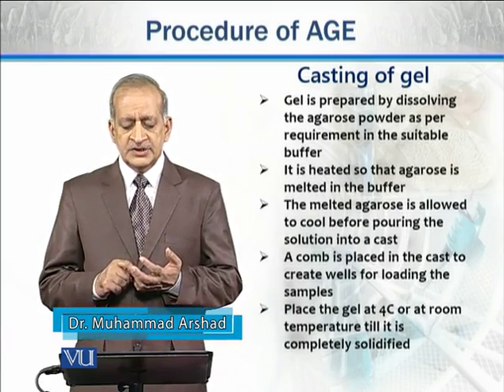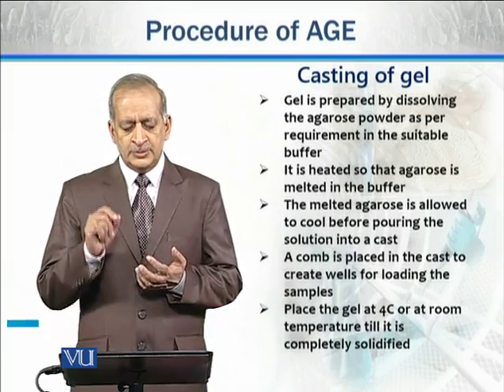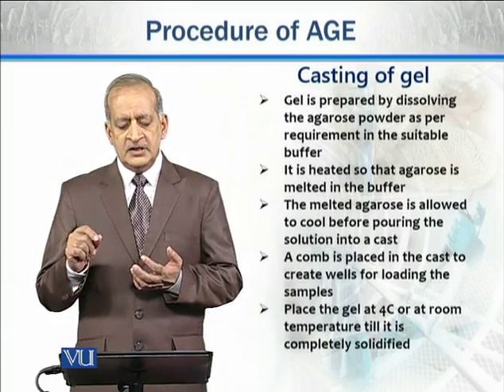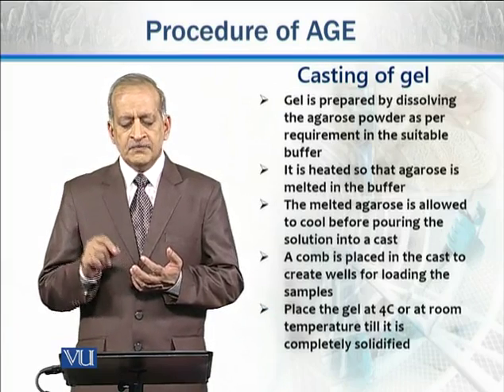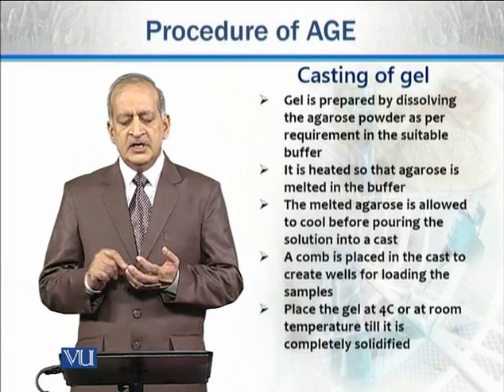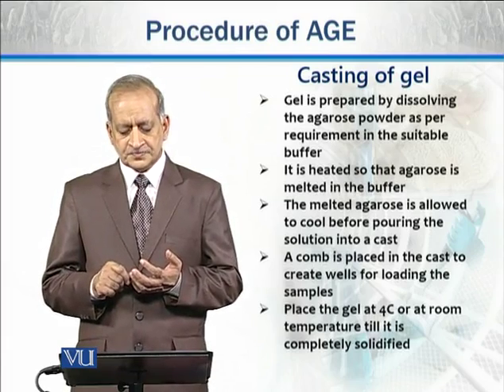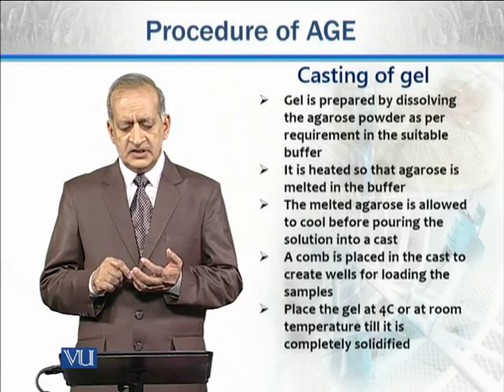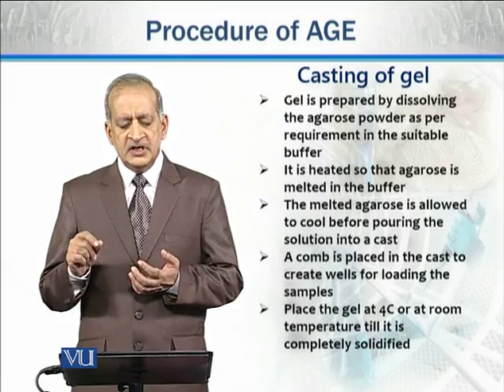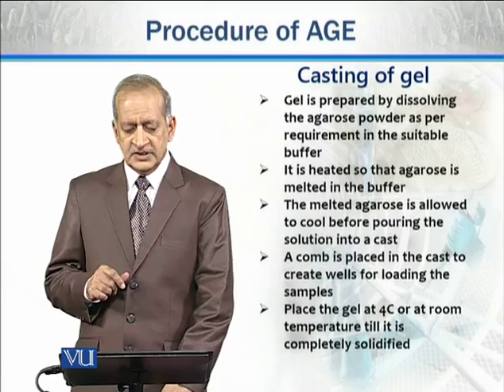The melted agarose is allowed to cool to some extent before it is poured into a cast. And then after pouring, a comb is placed in the cast so that wells are made where samples are loaded with the help of micropipettes. Finally, place the gel at 4 degrees or at room temperature till it is completely solidified before electrophoresis.